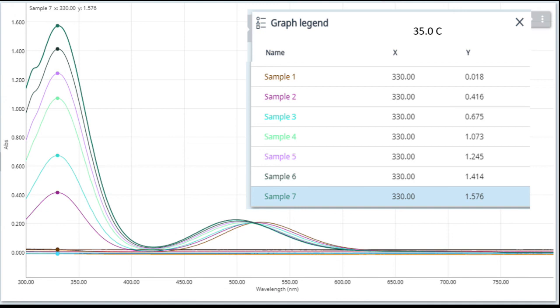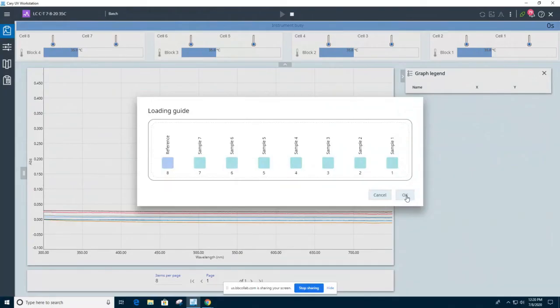You see there's a shift in that colored peak, which I've just blown up in the 500 range. But what we're really focusing on is the peak at the left. And all the wavelengths for the different samples, so sample 1 is solution 1, etc., are all on that chart. That is the data that you're going to use for your analysis in this lab. And I should say, at 35 degrees C, because this data was taken at the higher temperature.